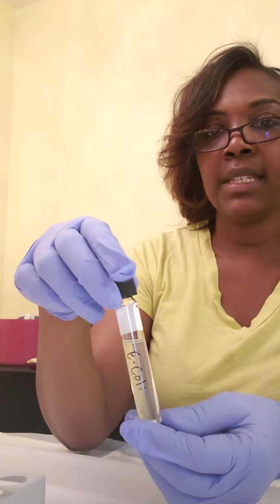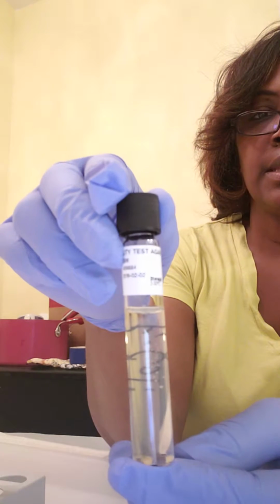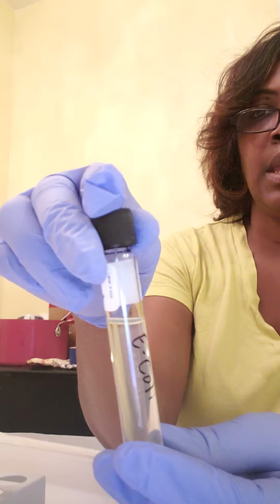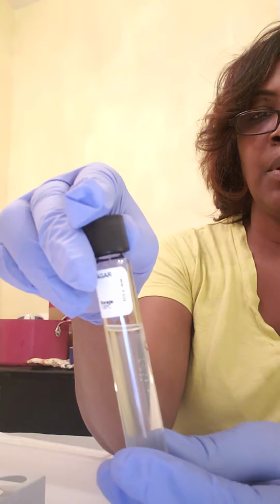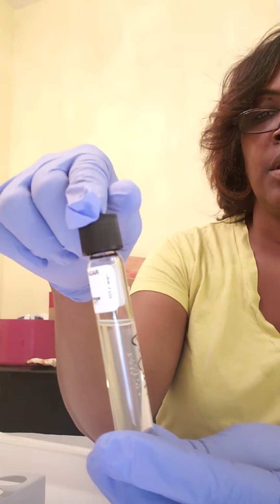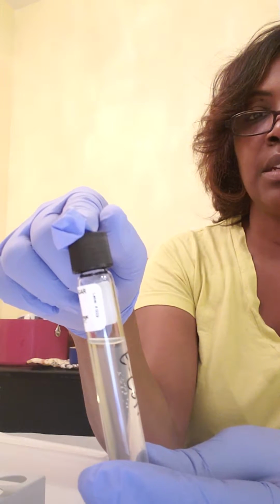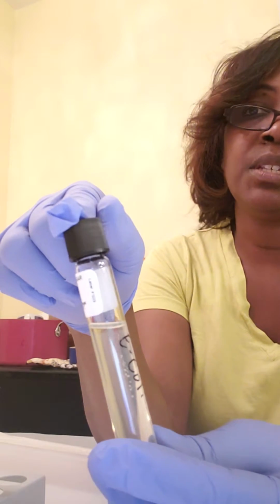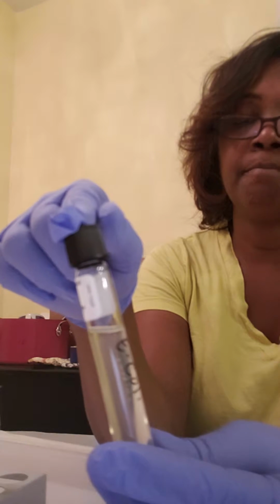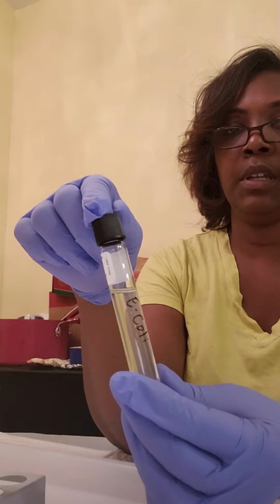The way that I can tell that it's negative, I'll try and bring it closer, is where I stabbed the paper clip with the straight motion down and straight out. There's no turbidity, there's no growth, it's just a straight stab motion, which means the motility in this tube is negative, and there's only growth in the stab. It's a little bit clearer.